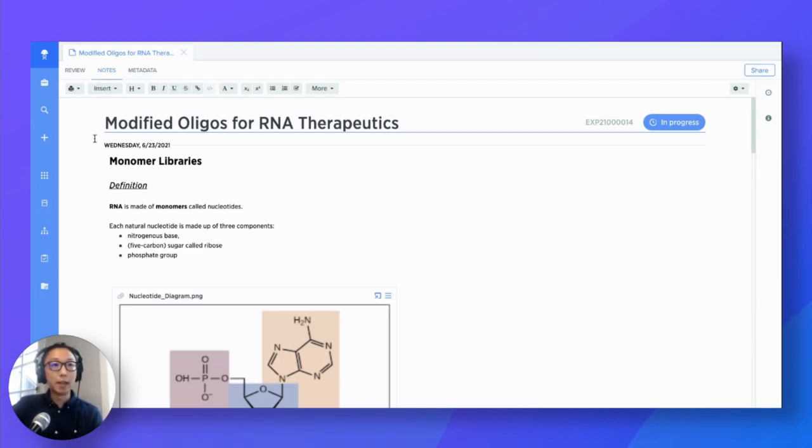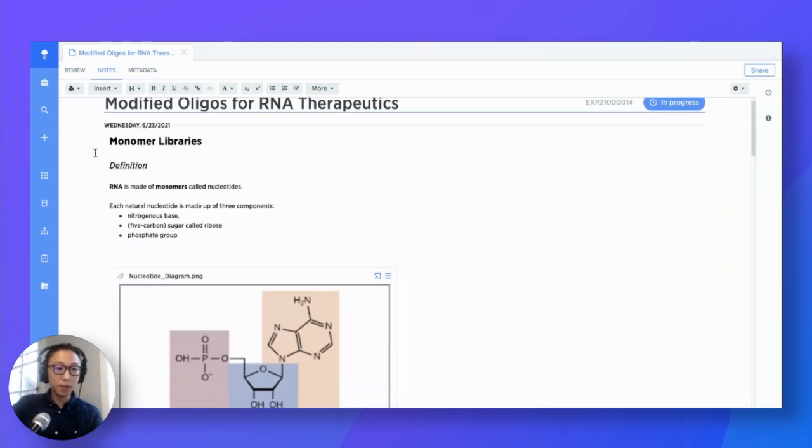Right now, I'm actually in a Benchling notebook entry, and so I just want to quickly walk through a few concepts and show you what we've built. So first, I mentioned that we have built out support for Helm directly into Benchling. And this means that we now have a standardized way of representing any sort of chemical modification on nucleotides.